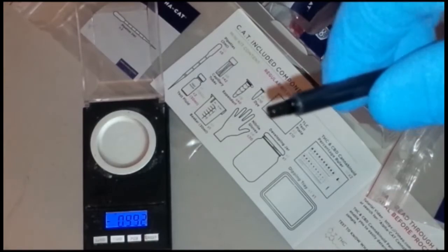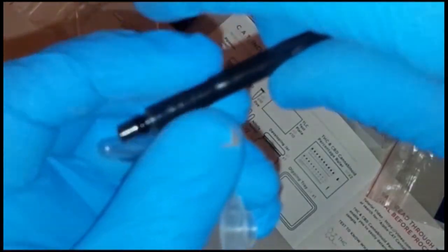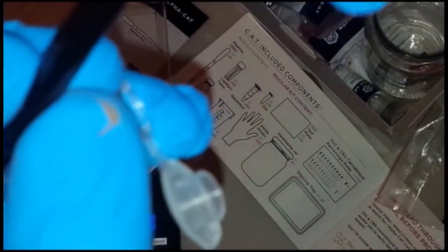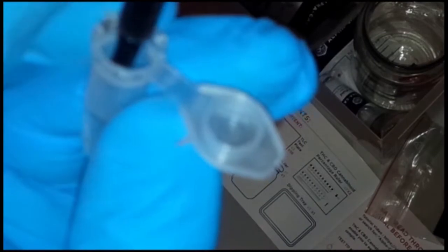The first stage is to weigh 100 milligrams of the RSO in one of the 8 Eppendorf tubes. We first tare the scale with the tube on it so we can get an accurate reading when the tube is weighed. As you can see, we have 100 milligrams of the Rick Simpson oil in the tubes. Make sure you are wearing the supplied gloves when doing this.